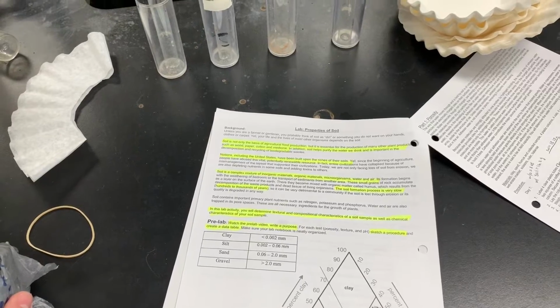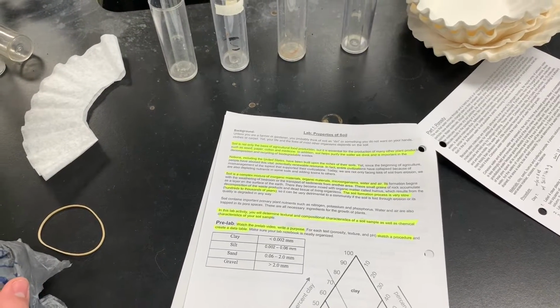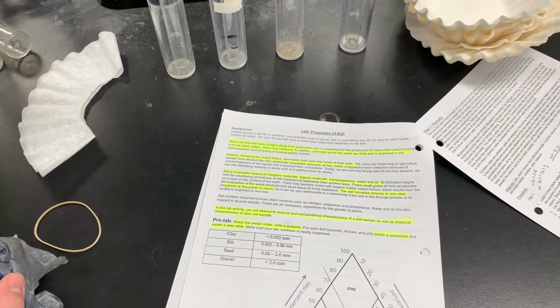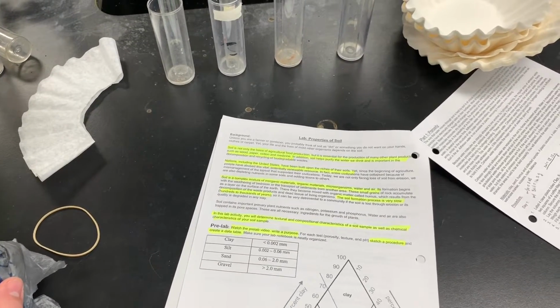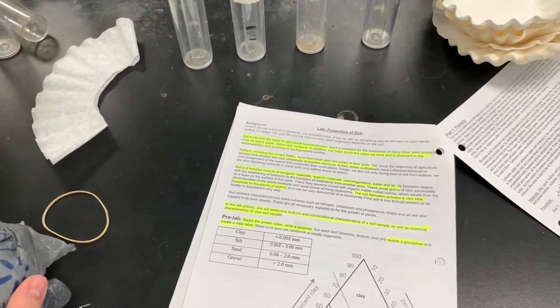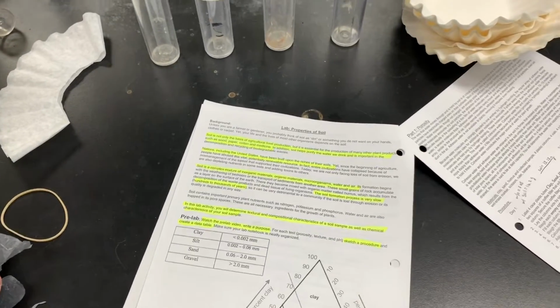In this lab activity, you're going to determine textural and compositional characteristics of a soil as well as chemical characteristics of your soil sample. So at this time, you're going to want to write a purpose, and then as you go through the lab, you're going to want to sketch a procedure and create data tables.